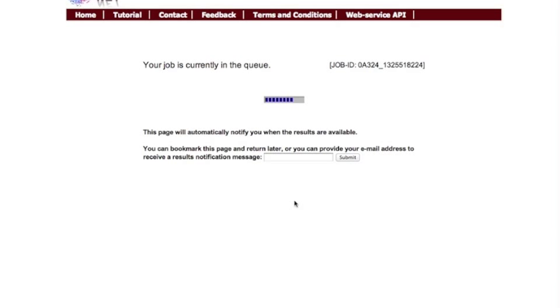After submitting your analysis, it will either run immediately or will be added to the queue. You can provide your email address to be notified when the results are available. However, the typical waiting time is only a few minutes.